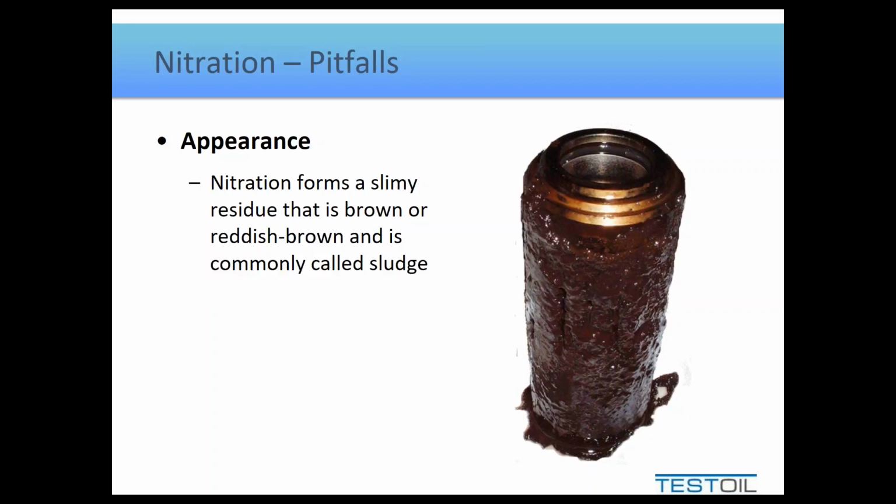It takes on a Vaseline-like consistency, and it tends to be that color that we would describe as reddish brown, or an Indian type red or roan red, whatever name you want to call it. But it is not necessarily a dark, dark color. It will have some undertones of red to it, and that doesn't really make much difference what type of base stock it is. You will typically see just varying shades of this color.